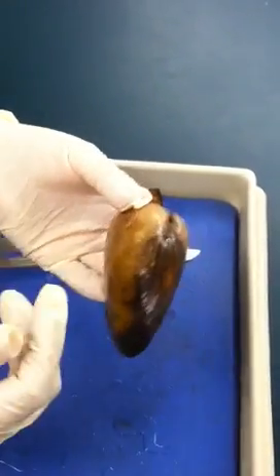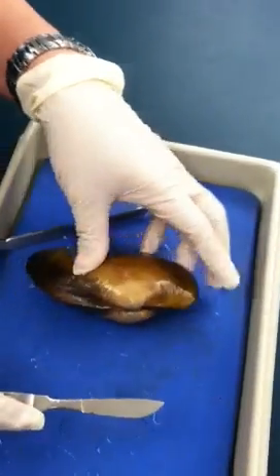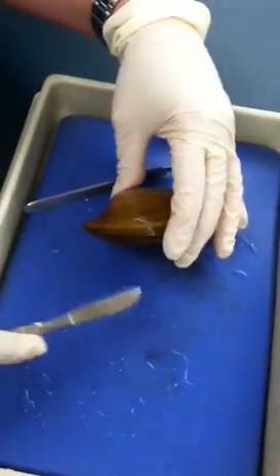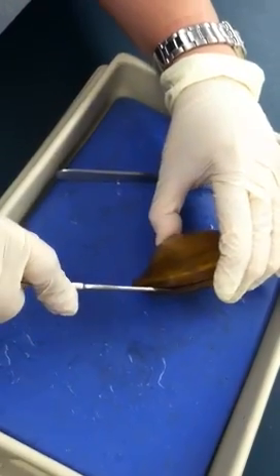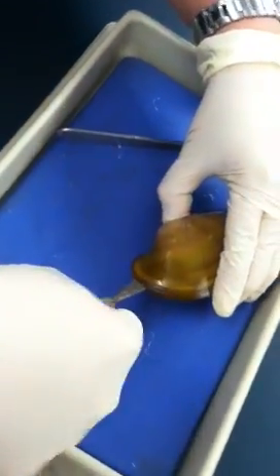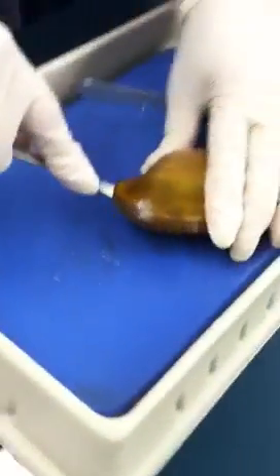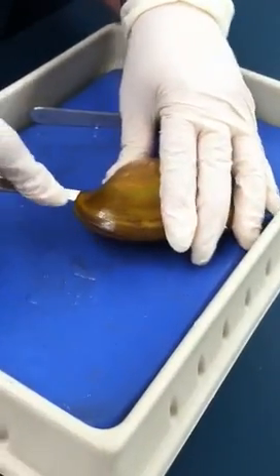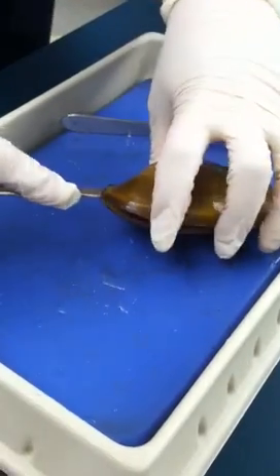Now we will cut it open after we identify all the structures. When you cut a clam, you always go through the outermost layer — go along the edge and then cut it. The muscle will be on the outside structure, so you cut just along the shell, and it will kind of open up.